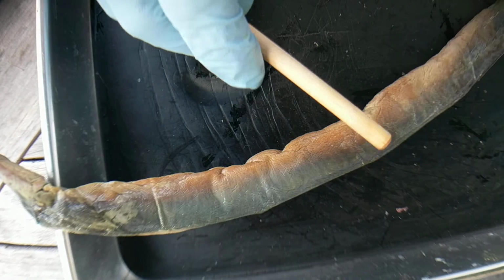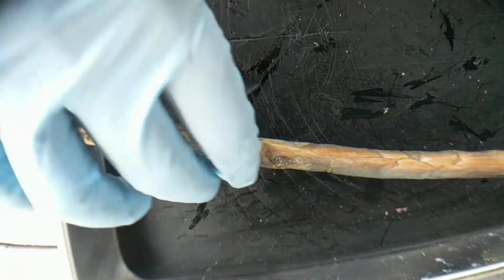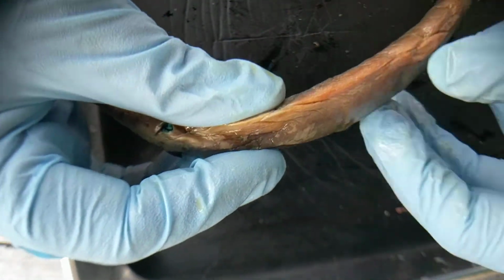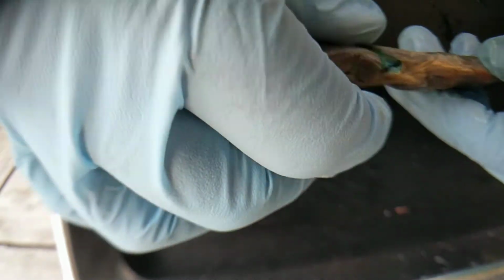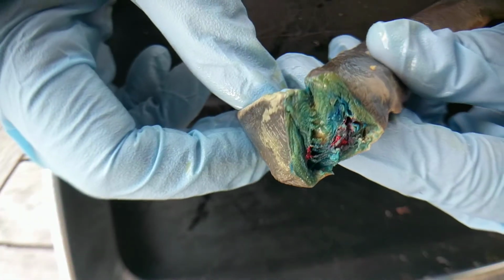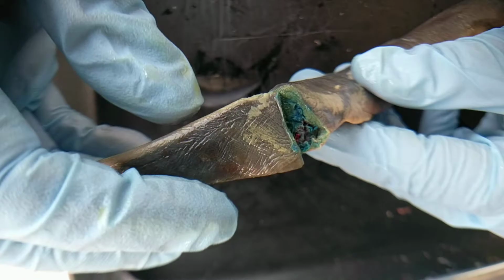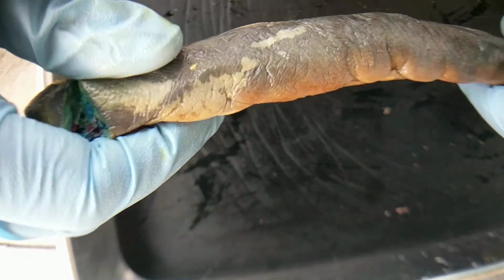And what else do I need to show you? Oh yeah, the urogenital papilla is back approximately here. There's an opening from the urogenital system and from the intestine. Actually, I'll show you this. This is where they cut it in the back and injected the arteries and veins with latex. So we'll see that in the other animals that we dissect this year too. So that's not normal in life, right?